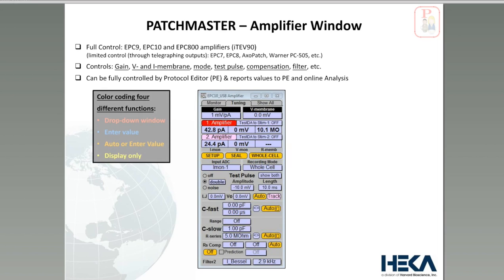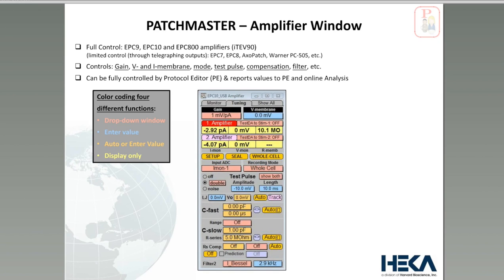This is totally optional. What you can do is you can change the background colors and the font settings of each of those little boxes in the amplifier window and in all the other windows. And this is basically how I like to do it. I use a different color coding for the function of the window itself. And I will get into this more during the live demonstration. But applying this color code to this window would change the window to something like this, for example.